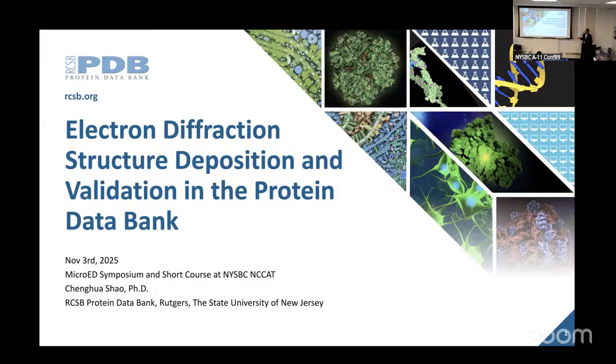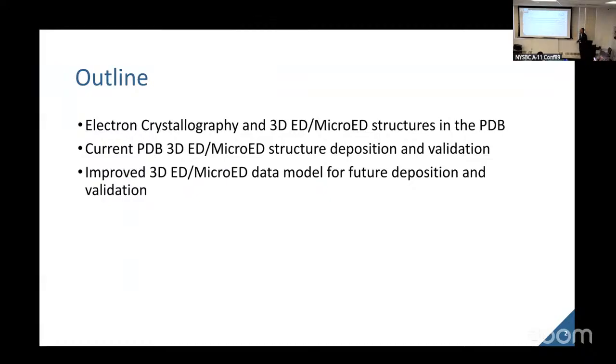So, having said that, today I hope I can achieve two goals for my talk. First, for students to briefly understand the 3D ED or MicroED structures in the PDB, and an overview of the deposition and annotation process, validation as well. And also for the experts in this audience, I want to introduce the improved data model for the future deposition and validation.